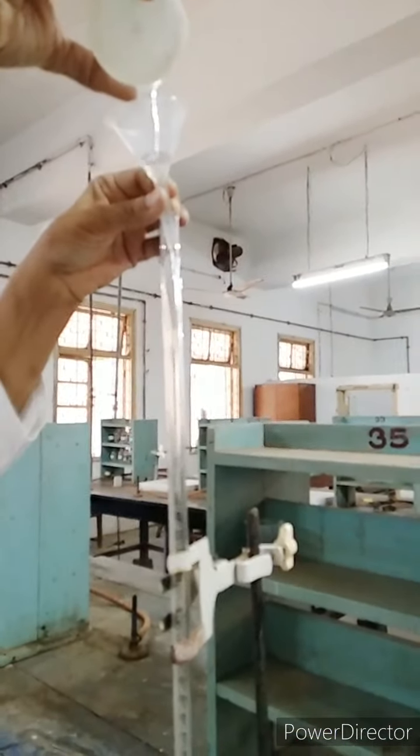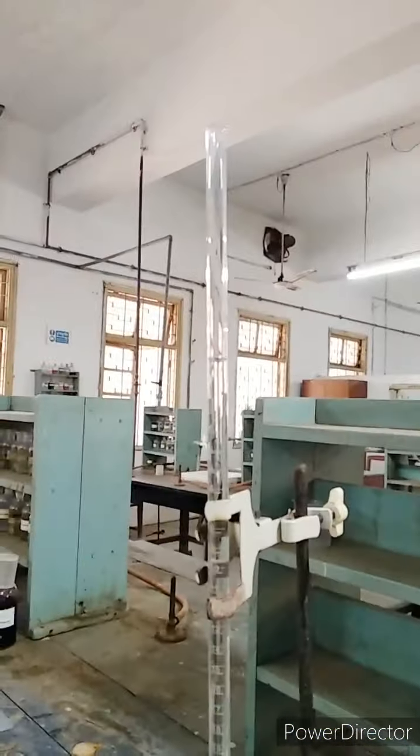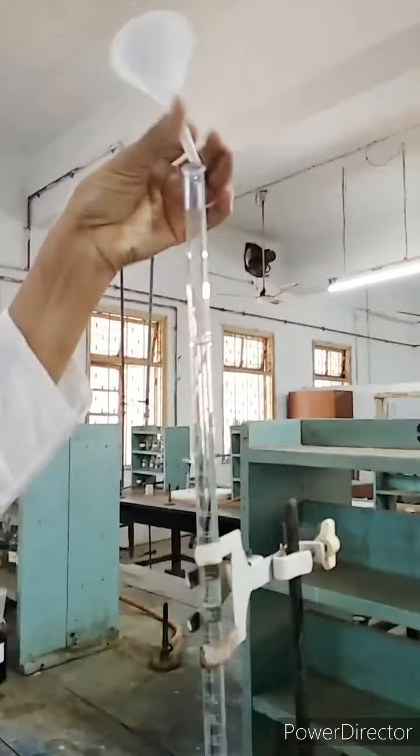As you can see, we are pouring the 0.08 normal HCl solution. There should be no bubble formation. So what will we do? We will pour the liquid straight to the bottom of the burette.